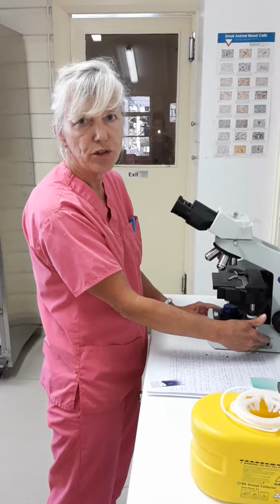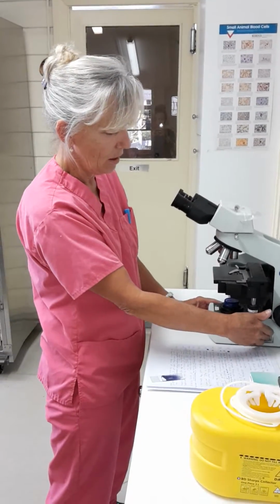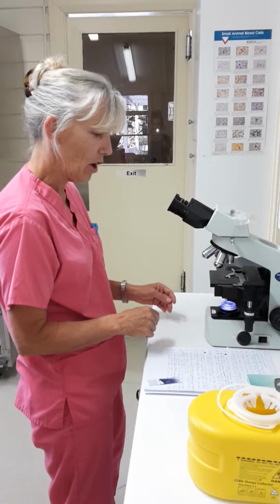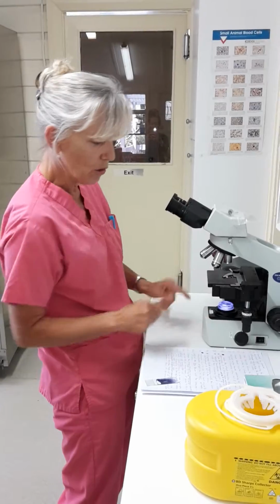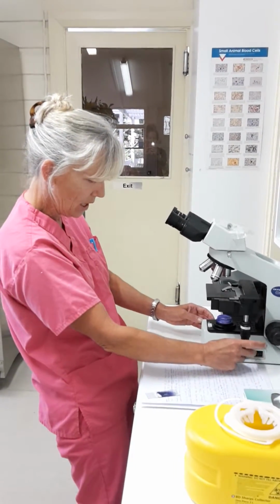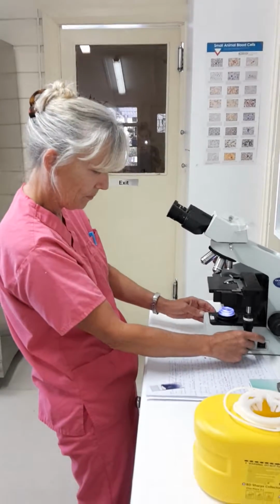Familiarise ourselves with the use of our microscope. We switch it on at the power source here, which gives us our light source. We're going to adjust the light source to its brightest using this little knob down here. It's now down low and it's now up to its highest.